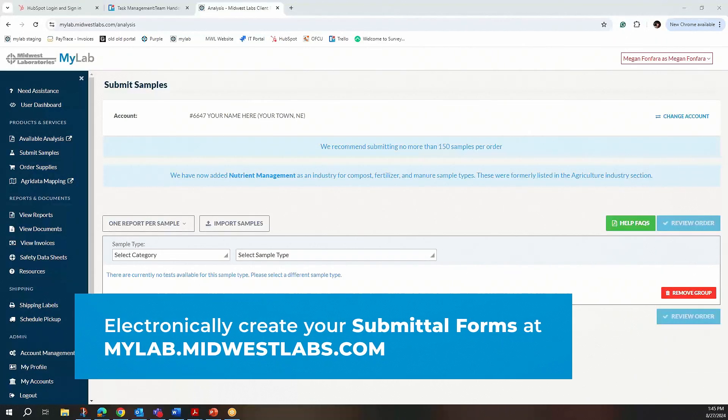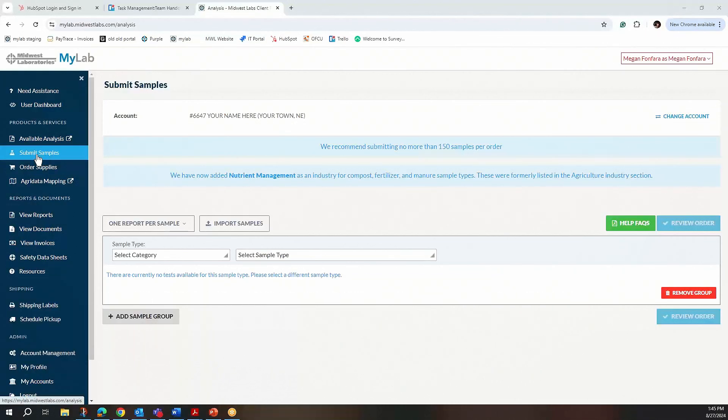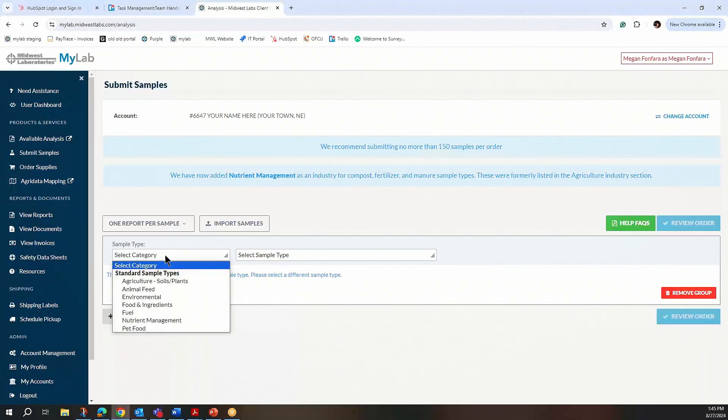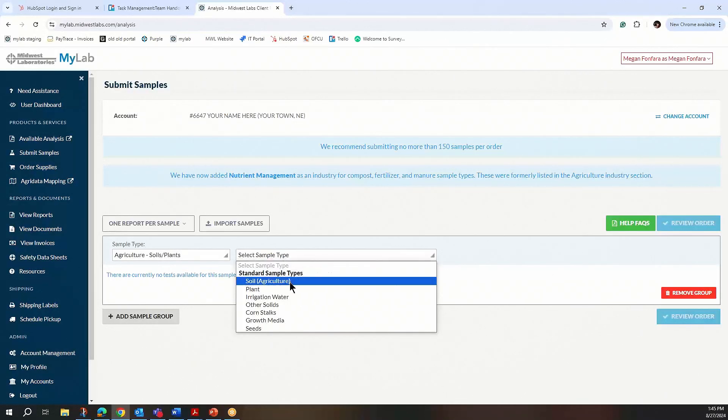You can also submit your sample paperwork on the portal and then print it off to bring in to our office with your samples. I'm going to show you how to do that today. You'll go to mylab.midwestlabs.com and click on the Submit Samples tab. Under Sample Type, you'll choose Agriculture — that's your industry — and then the sample type you're dropping off is soil, and this will populate your submittal form.